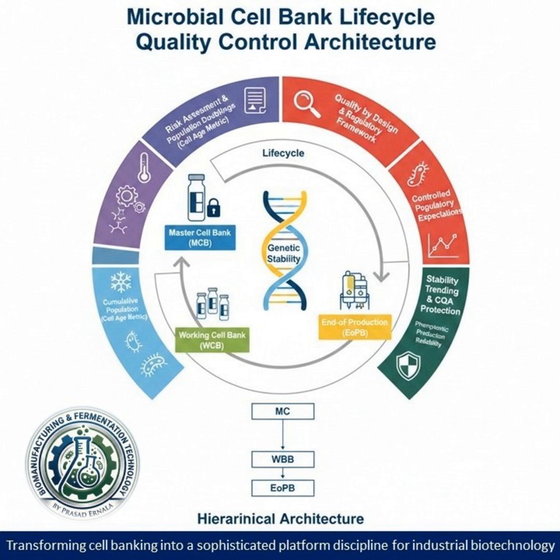With E. coli, it's all about osmotic shock. Their membrane architecture makes them very sensitive, so they need moderate cryoprotectant levels, maybe 10 to 20% glycerol, and very carefully controlled cooling rates. And that's especially true if the product is in the periplasm. Especially then, because any membrane damage during the freeze-thaw can cause leakage and ruin your product.